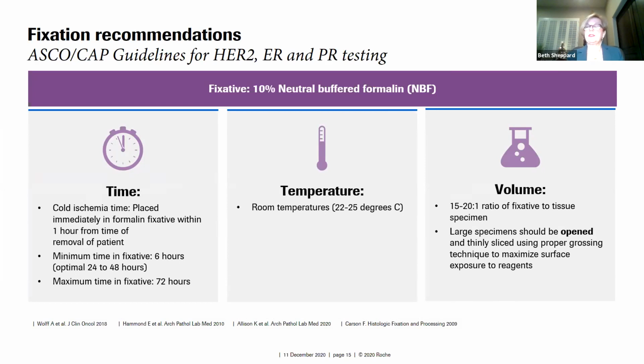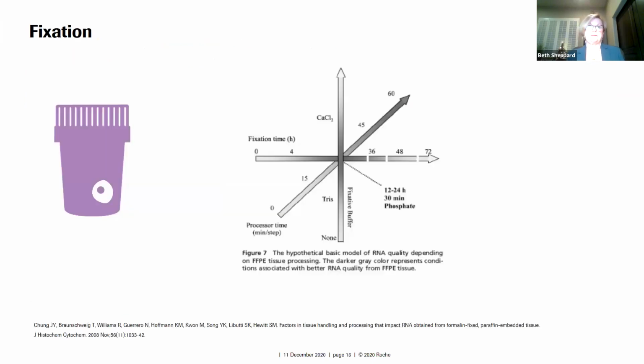And I think you're going to see some new regulations that are going to recommend that 48 hours be the most, although this guideline does say 72 hours. The temperature should be room temperature and the volume should be a 15 to 20 to 1 ratio of fixative to the tissue. And large samples should be opened and thinly sliced using proper grossing techniques.